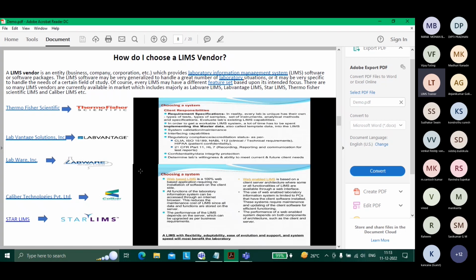It depends on what kind of work you are doing in LIMS. If you are doing basic admin processes or lab analyst kind of roles, you don't need coding. But if you are taking a developer kind of role for LIMS, where you are doing configuration, then absolutely yes, you need to know some coding.